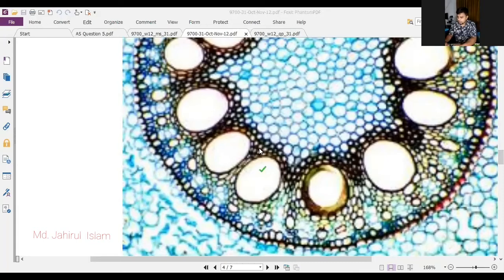as well as beside it this is xylem. Okay, so you will just select one large cell, and there will be some surrounding small cells. You will select one bigger cell and then 3 smaller cells from here, and then you will draw a large drawing. It is called a detail diagram also. Okay, so I'm going to show you how to draw it.